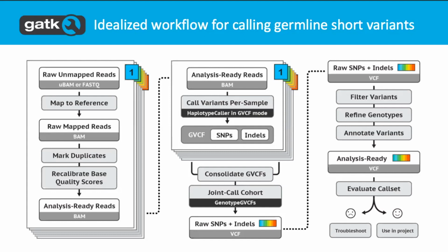If you're talking about a handful of samples, it's likely that the CNN approach might already do better and be more worth it from an implementation standpoint. Also, in a clinical context, there's a reluctance to use other unrelated samples, because, depending on the type of clinical pipeline you have, if you redo your analysis with other background samples, the results are not exactly reproducible.